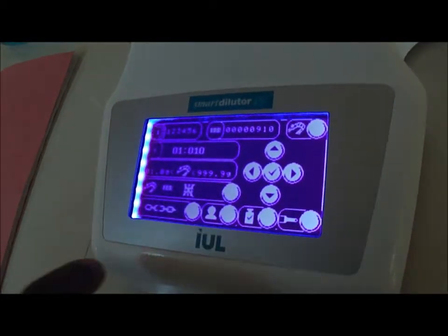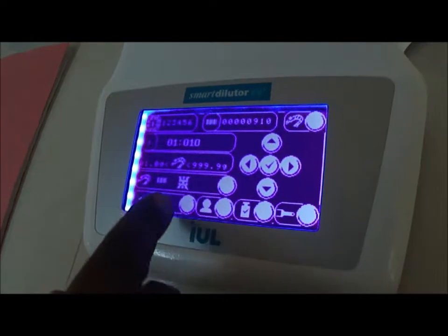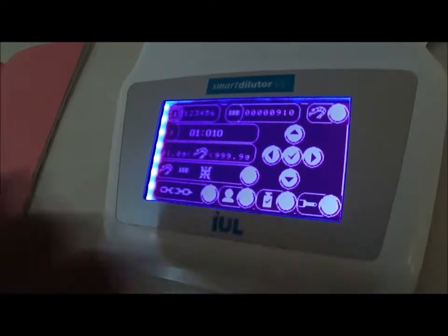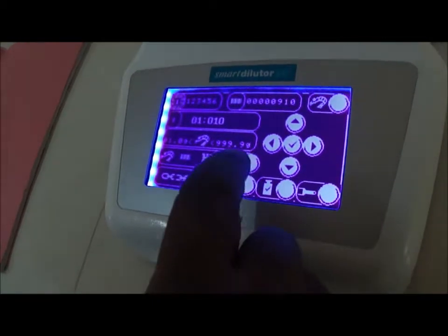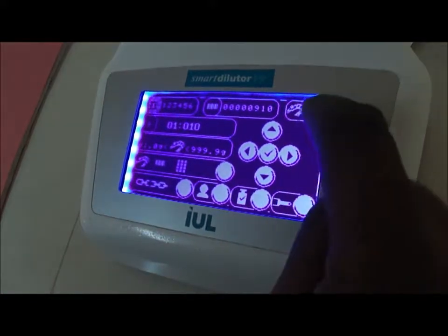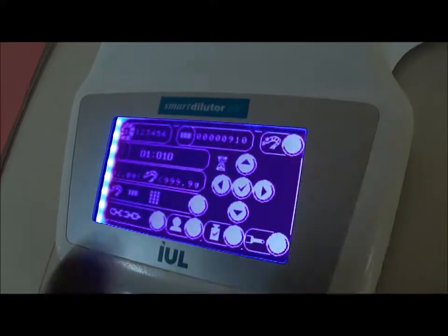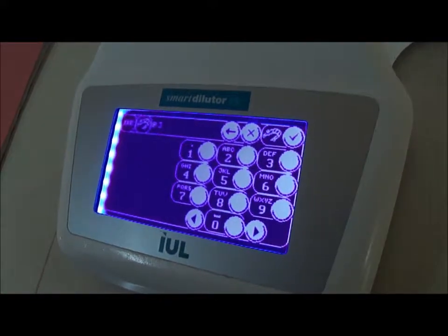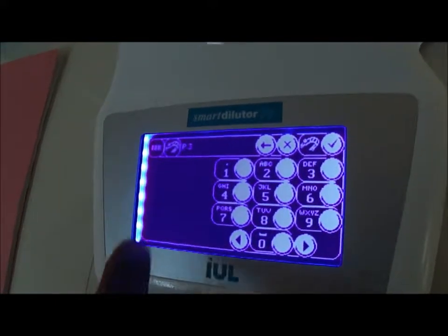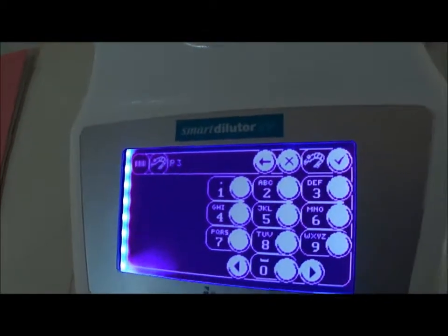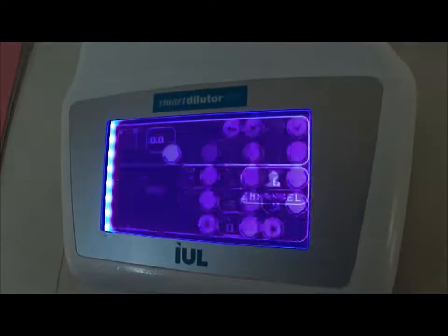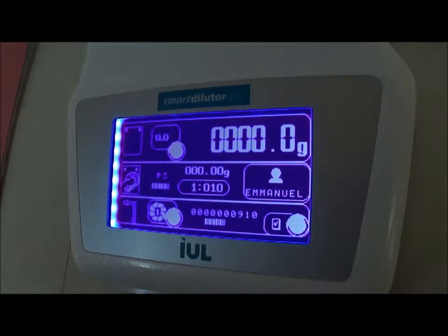If I push here, the keyboard is crossed. It means that the machine itself will provide the ID to your sample. But if I push again, it's uncrossed. Then, if I press the turn button here, it will show me a keyboard, from which I can enter the number or the ID of my sample, by just pushing this button here. Okay, if I'm done, then I go back here, and then I'm again in the first screen.